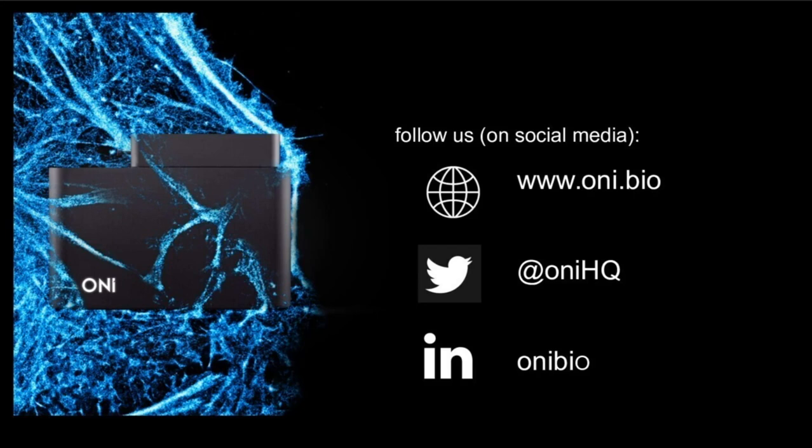Thank you, Lara. I think there are some questions about the EV. Yes, we offer the EV kit for that, and the EV kit has cartridges, and unfortunately the cartridge is not reusable. So like I said, we are past the hour, so I think this is a good moment to end.